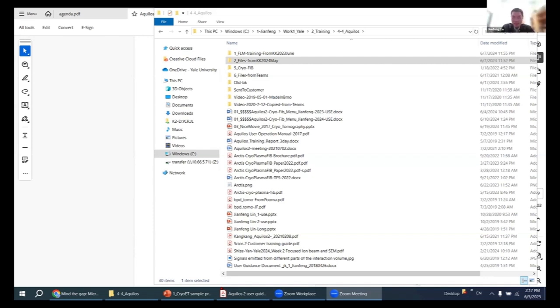So again, I don't want to mislead you. I just try to say a number, which just says we don't like to keep the sample in the chamber, where the vacuum is not good. Not like in the autoloader. Even in the autoloader, where the vacuum is far better, we are still concerned about contamination. So if we don't use the microscope, and the sample is still in the autoloader, we still turn on the turbo pump. But if the sample is in the chamber, the vacuum, even though it's high, compared to the autoloader is not good. So we feel uncomfortable, and we always try to minimize the time the sample stays in the chamber.